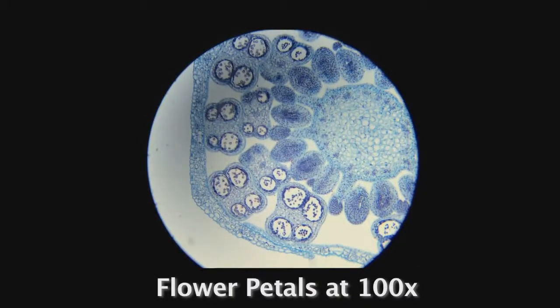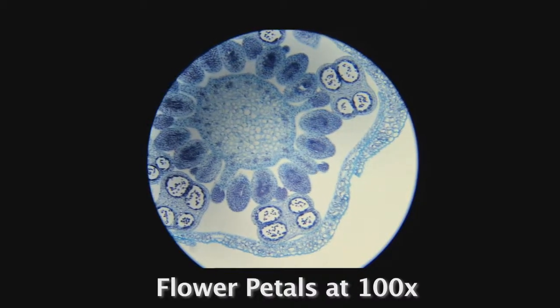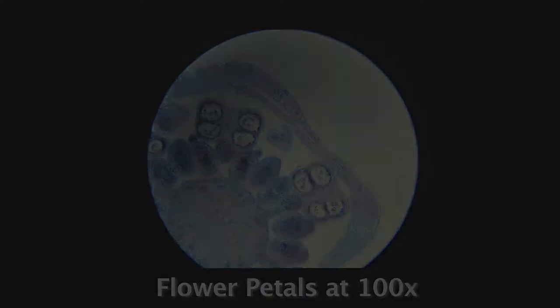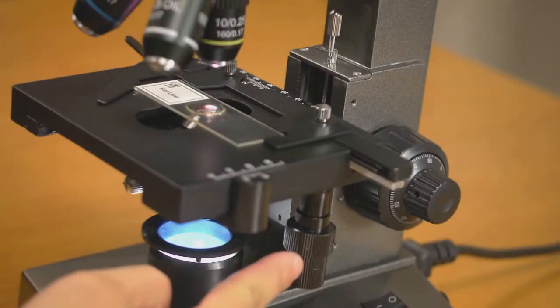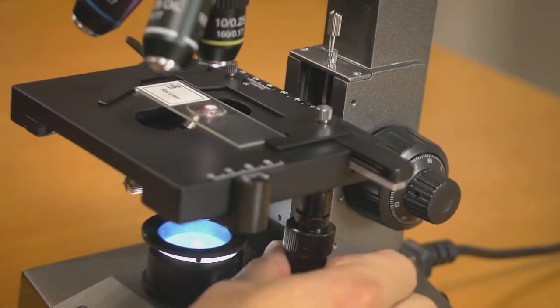When using a microscope for research, precision is very important. The mechanical stage allows you to explore the entire slide with increased control and stability. The two knobs stacked together give you complete control when moving the slide up, down, left or right.